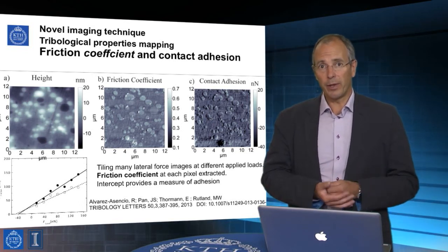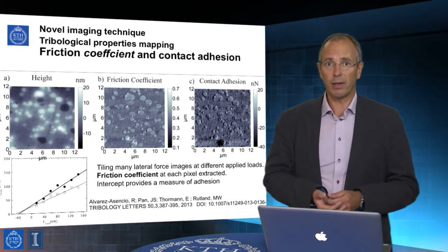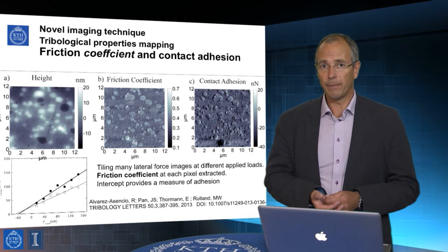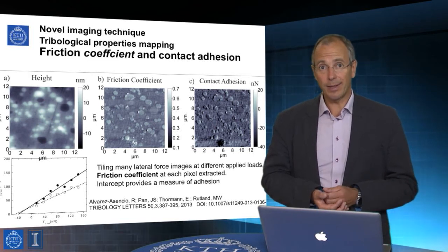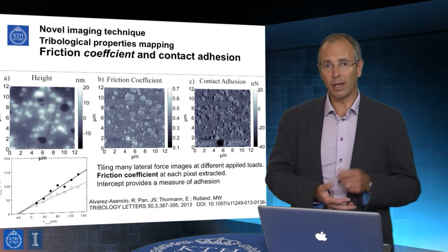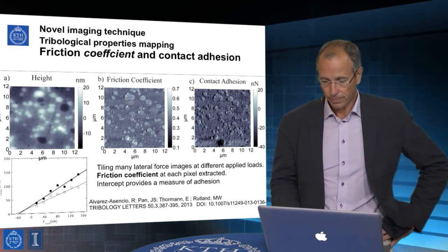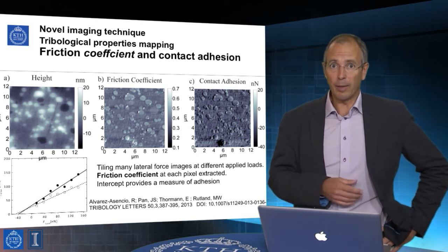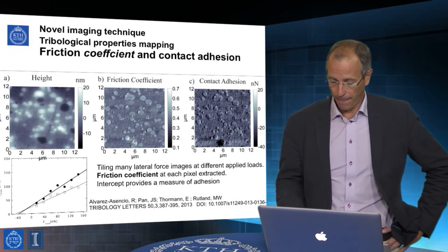And it's perhaps worth noting that from that technique we can also, as a sort of a freebie, extract the adhesion at that point between the tip and surface without actually separating the surfaces, which is an interesting little twist in that, which I think is the only means of doing that. And the argument can be raised as to whether it's a reasonable measurement of the adhesion.